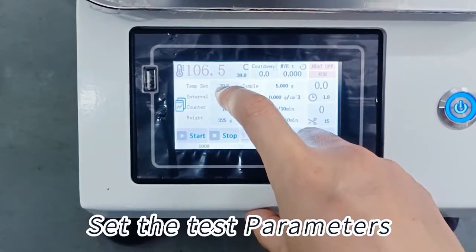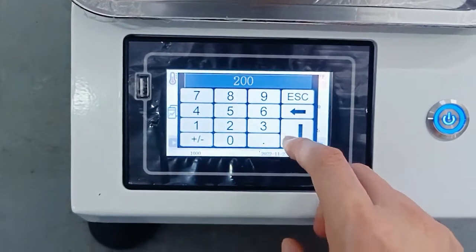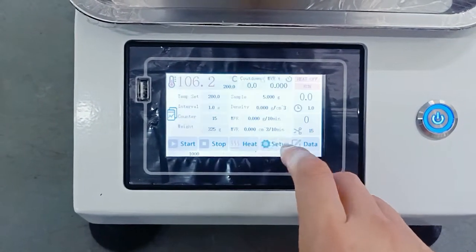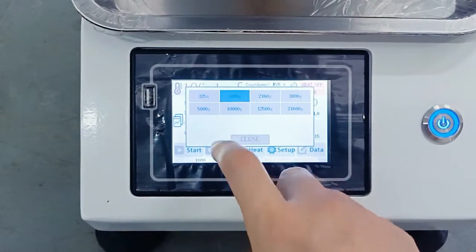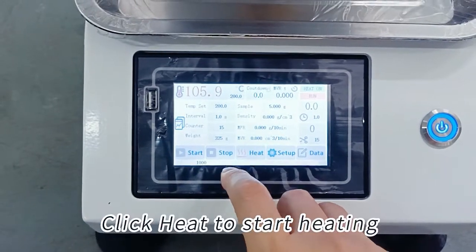Set the test parameters. Click heat to start heating.